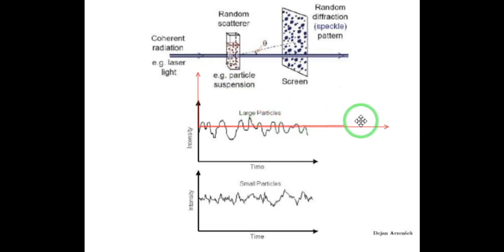Maybe you will have the question in your mind of why they exponentially decrease from 1 to 0. Where does this 0 come from? Well, of course, the light intensity never reaches 0, but we can move our reference onto the mean value. Let me introduce the m here, and the mean value we want to consider as being 0.